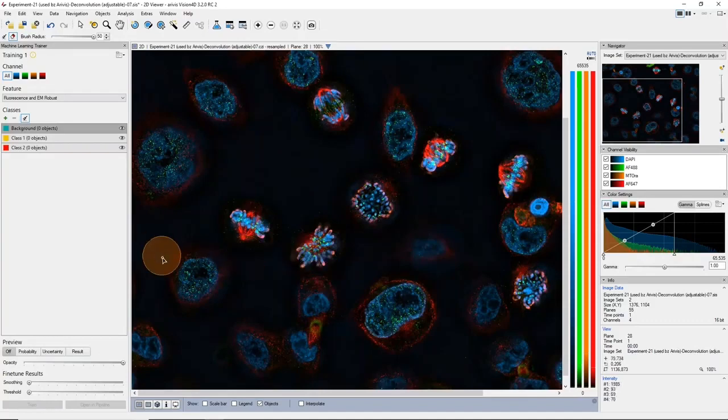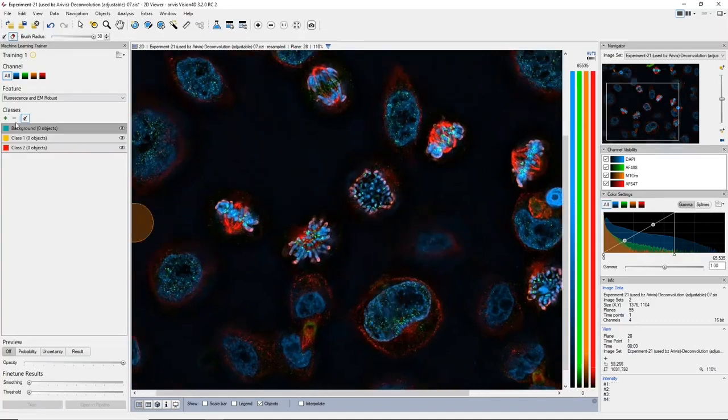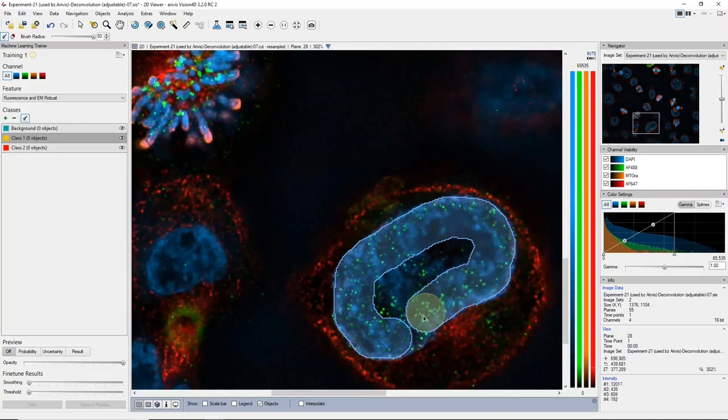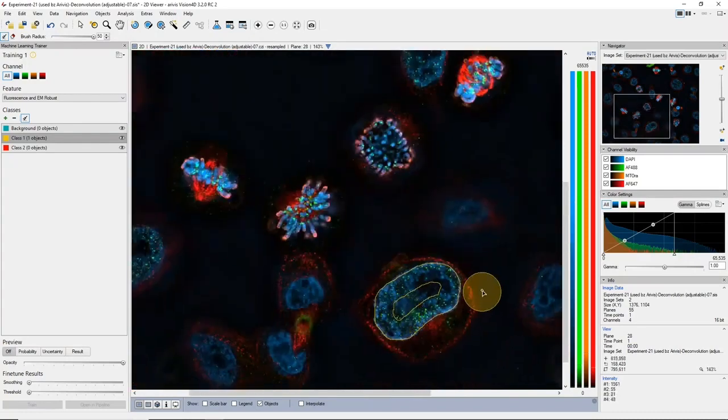But essentially here, what you could do is say, right, if I select, for example, class 1, I could say all of the pixels that look like this are representative of my class 1 of objects. So I make the point of making the distinction to say these are pixels that are representative of class 1.